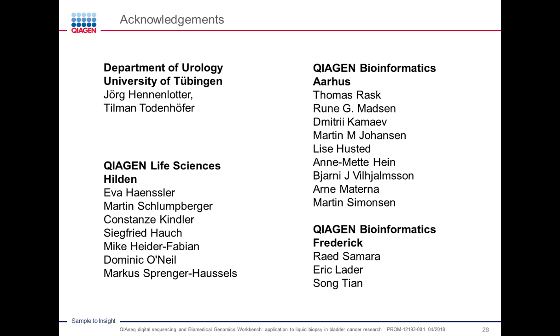So the user will find all key parameters to be already pre-configured according to the panel that they select in the initial guide that I showed in one of my screenshots. So the user really doesn't need to configure anything other than selecting which panel they used for their sequencing.